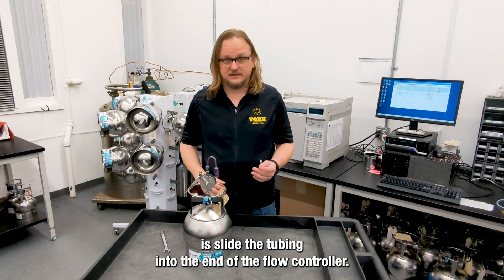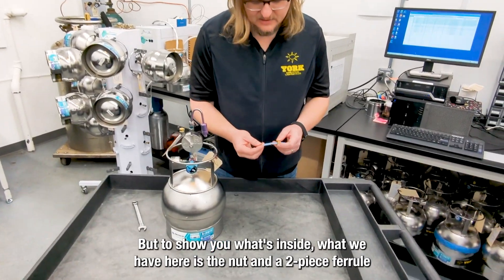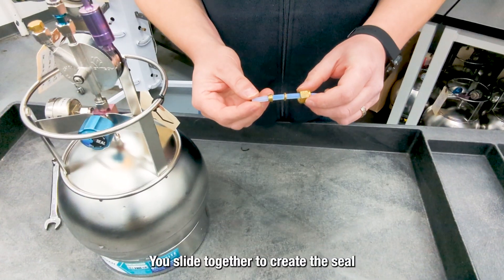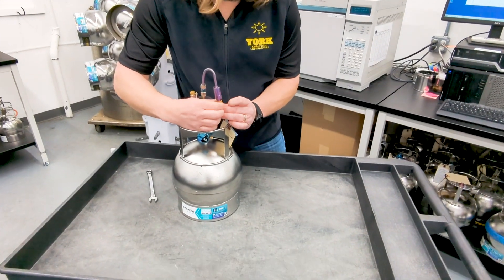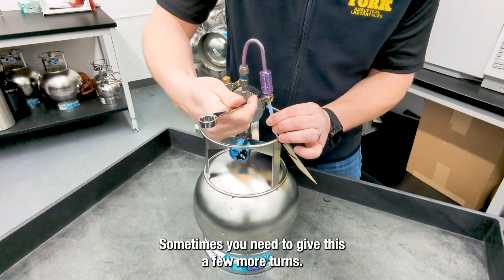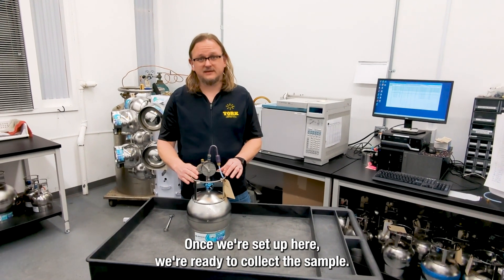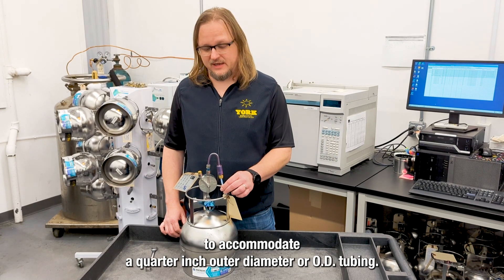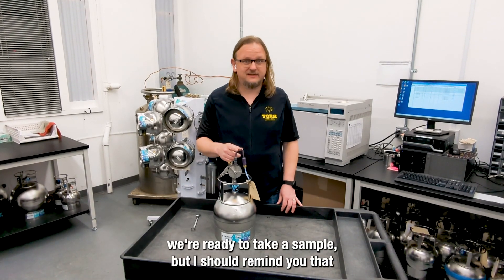Normally, all you need to do is slide the tubing into the end of the flow controller. But to show you what's inside, what we have here is the nut and a two-piece ferrule. These slide together to create the seal — tightening this down to create a seal. Sometimes you need to give this a few more turns to make sure you're secure. It's also important to note that the flow controller is only set up to accommodate a quarter-inch outer diameter, or OD, tubing.